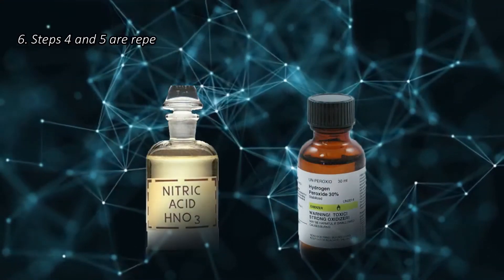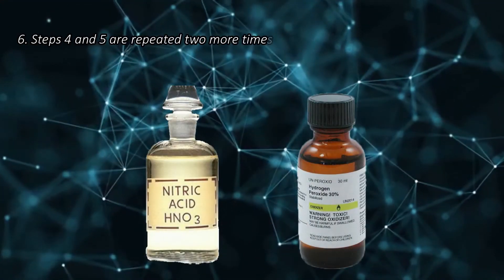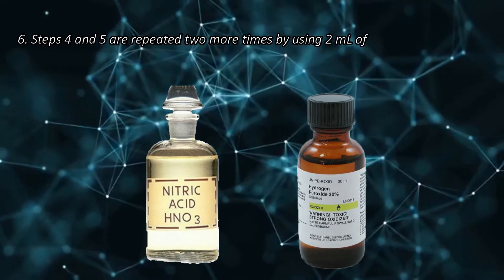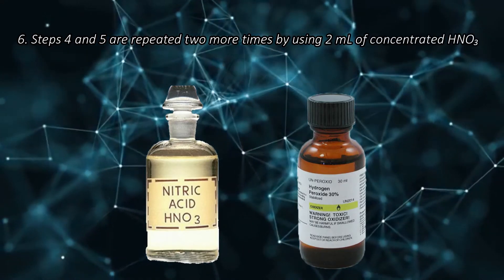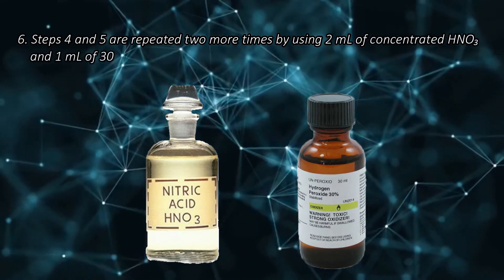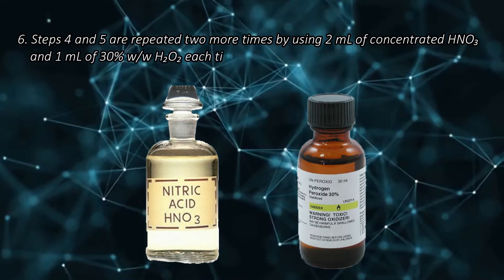Step 6. Steps 4 and 5 are repeated two more times by using 2 ml of concentrated nitric acid and 1 ml of 30% weight-over-weight hydrogen peroxide each time.